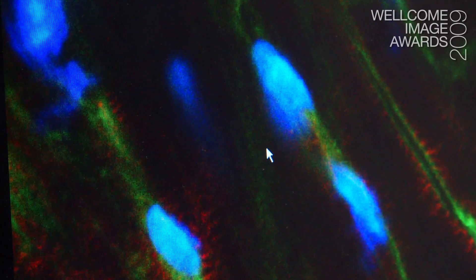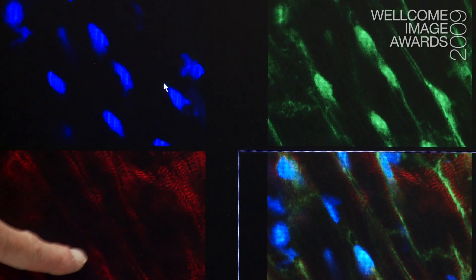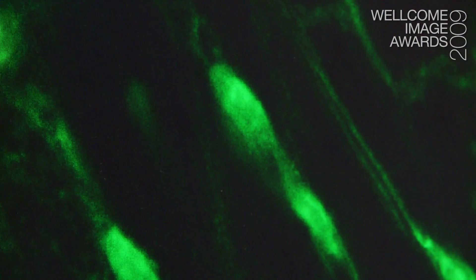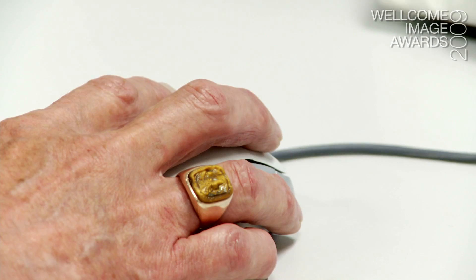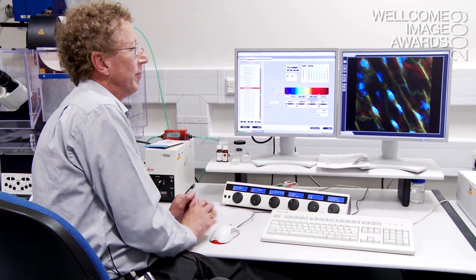This is an image of some mouse muscle tissue and it's been stained with three different fluorochromes. The blue is detecting the nucleus and the green and the red are staining other parts of the muscle. It's been acquired using three lasers — a laser to excite each of the three colours. And once you've got your three separate images you can merge them to give all three together.